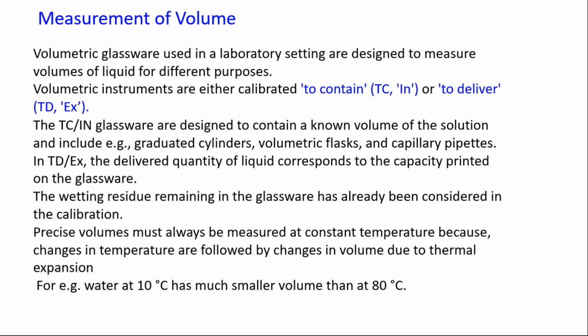So the pipettes or the standard flasks, if it says TC, all the standard flasks will say TC. It is meant to contain. And if you have TD, what you see in pipettes, that means it is to deliver. The TC in glassware are designed to contain a known volume of the solution.